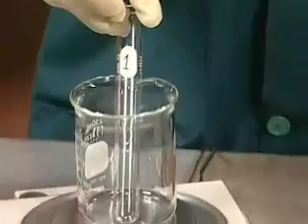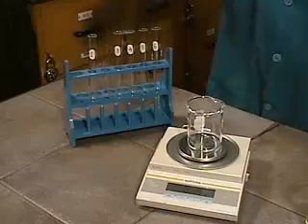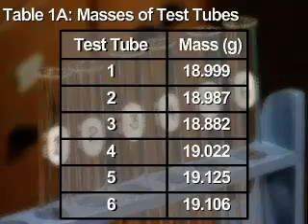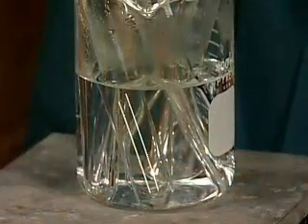The individual mass of 6 empty test tubes is determined. The test tubes are placed in a hot water bath.